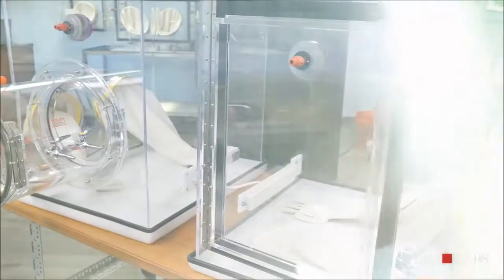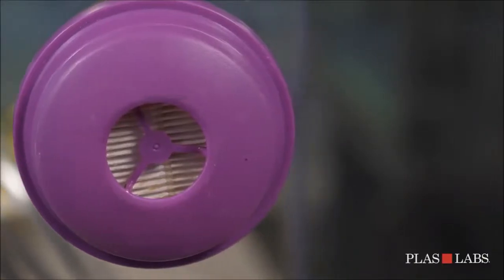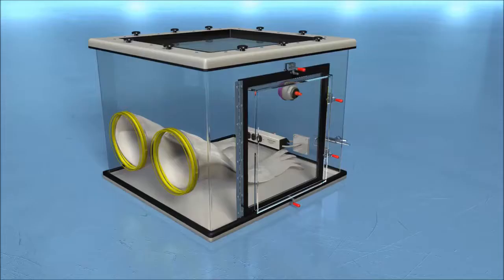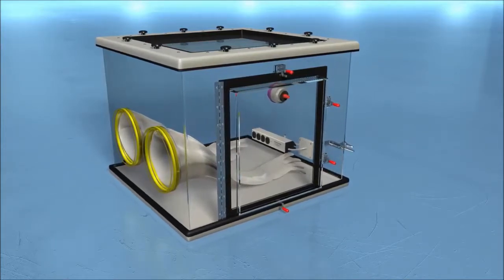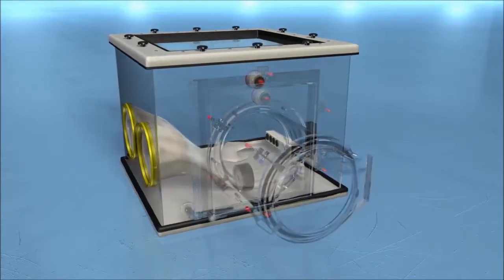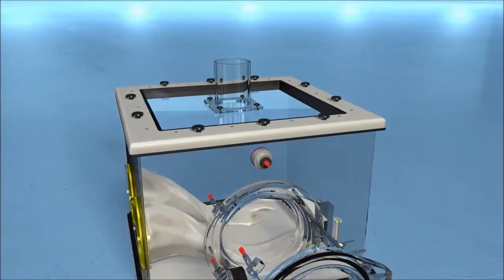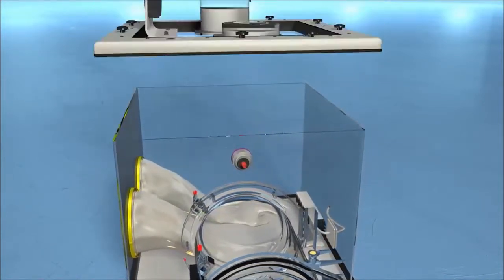The 830 series can also include these popular accessories: flat access door mounted on side or on the front, top-mounted vent for house exhaust hookup. HEPA filtration systems can also be added to the 830 series glove box.